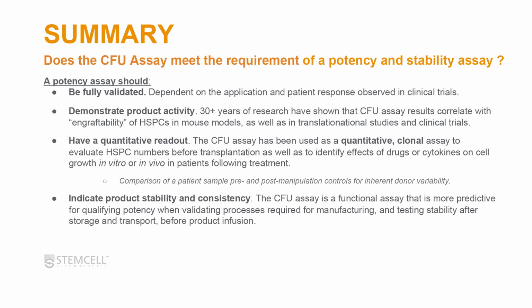And can it be validated? Well, the CFU assay has been validated in some cases for different purposes, like the ability to identify the maximum tolerated dose of chemotherapeutics by adding drugs into the CFU assay and looking at IC90 concentrations, for example. But in this case, it really depends on your application and the patient's response observed in the clinical trial.